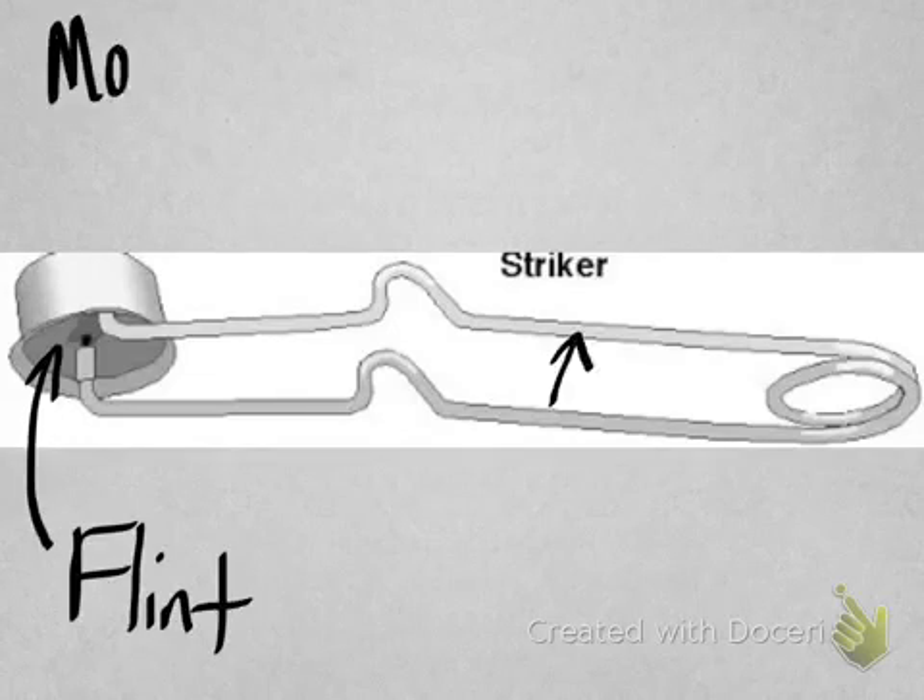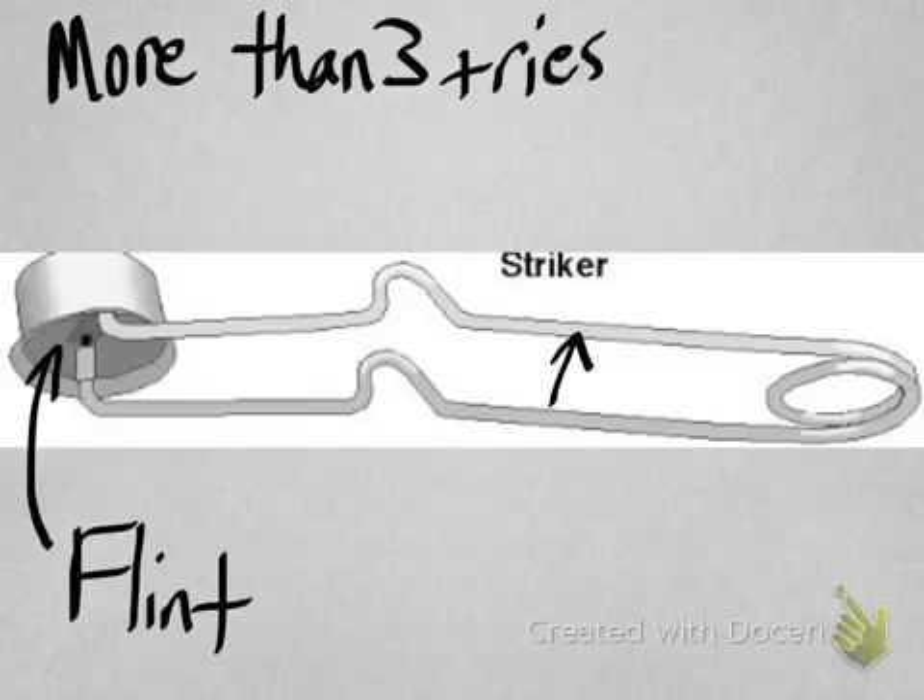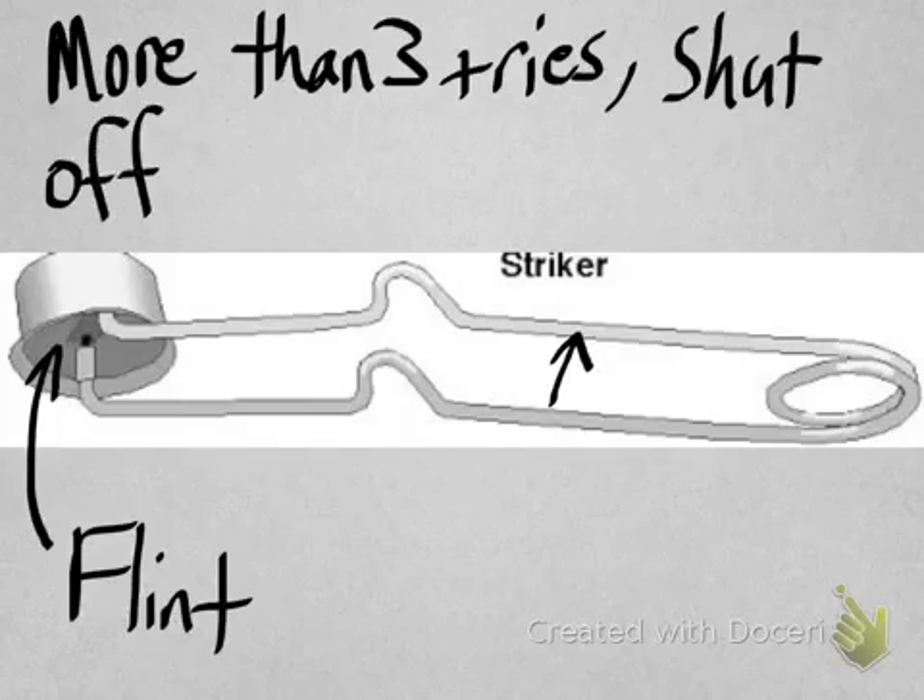The next step is to use your striker to actually light the burner. First, open up the gas source, then use your striker, which has a flint on it that rubs against a rough metal surface to create a spark. The gas coming out of the burner will encounter the spark and ignite. If you can't get the burner lit within three tries, shut the gas off, let it clear, and then try again.